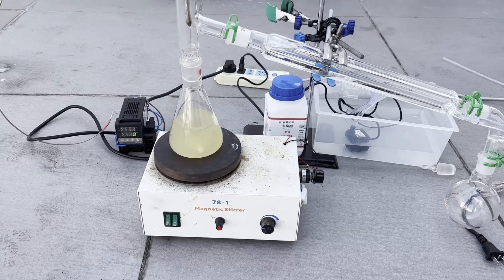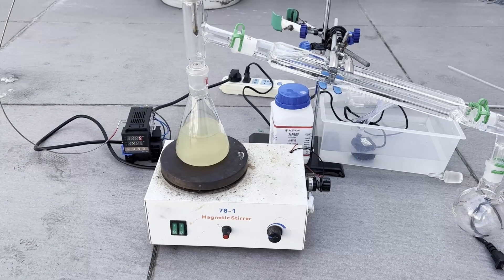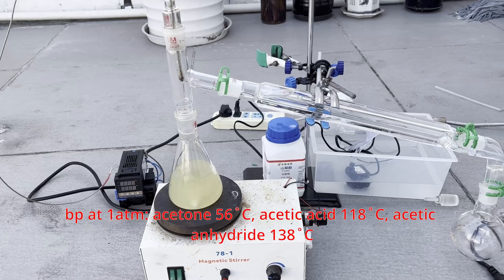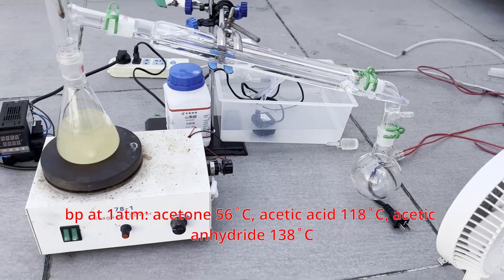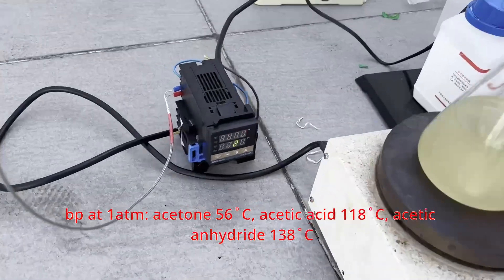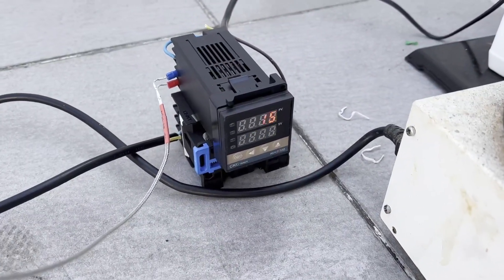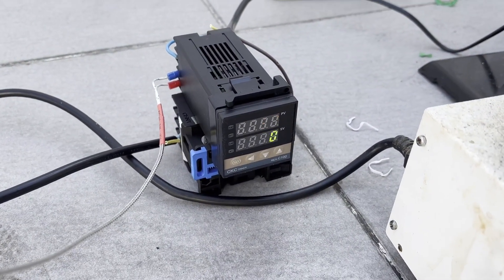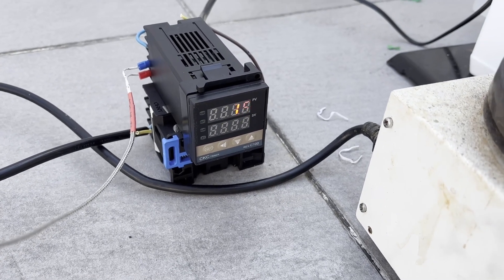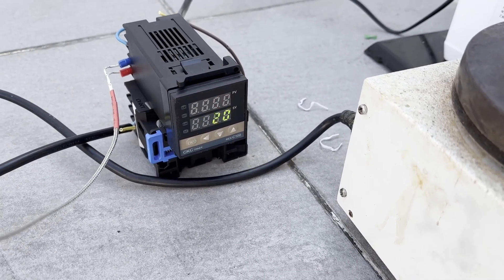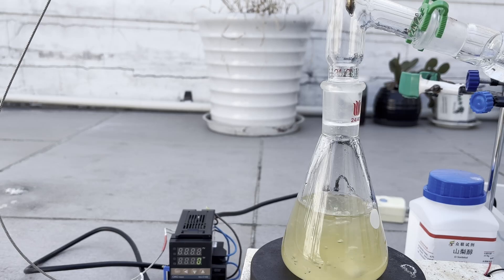Anyways, I disassembled the apparatus and proceeded to distill the liquid in the conical flask. Acetone boils at 56 degrees C, acetic acid at 118 C, and acetic anhydride at 138 C, so a simple distillation setup is probably more than enough to separate them. I also connected a new temperature control module that I bought, but it didn't seem to work well, and its temperature measurements are very inaccurate, so ignore the temperature displayed on it.